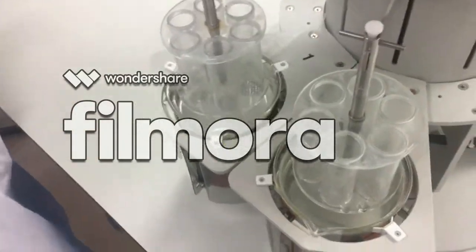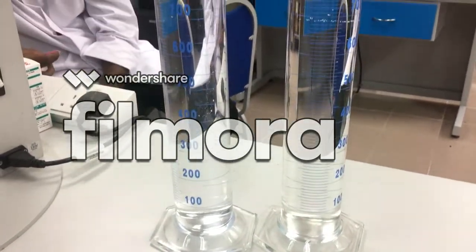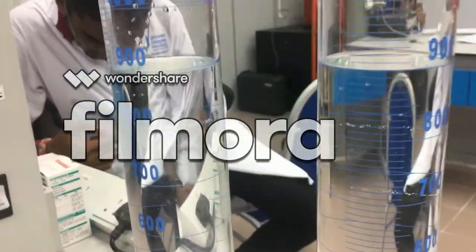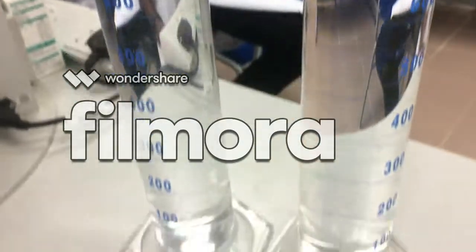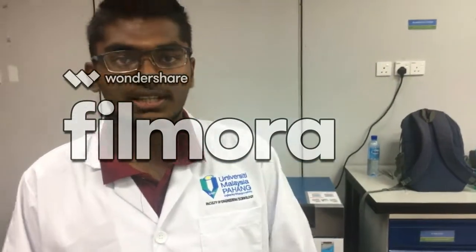So the factors that affect this are the temperature and also the time. As I mentioned before, the time for the uncoated tablet is lesser than from the theory, but for the effervescent it is according to the theory.